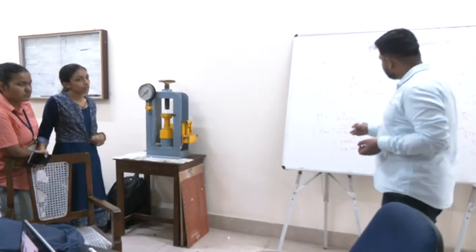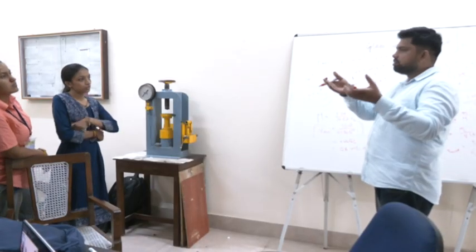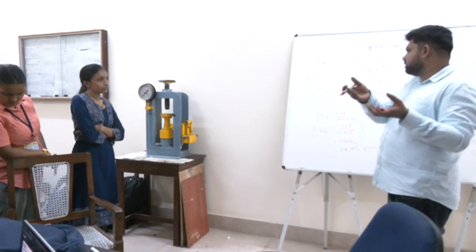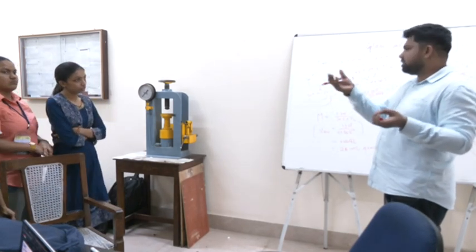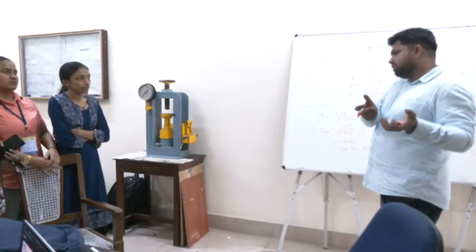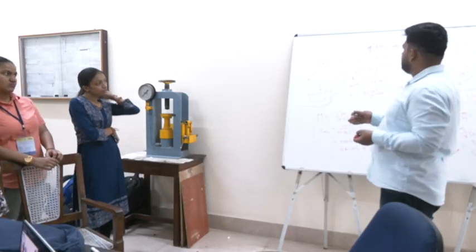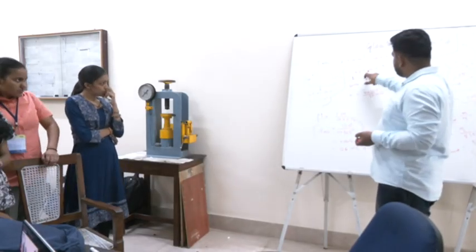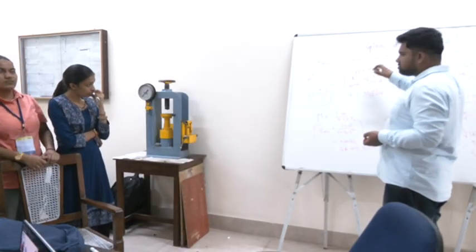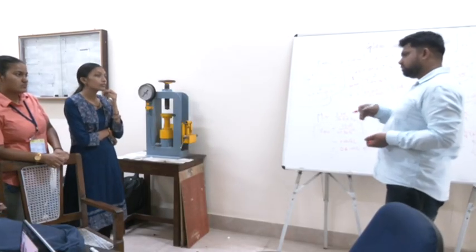Sometimes it happens that we take concentrated HCl directly from the bottle, 36%. It is pure HCl. At that time also, sometimes we don't get the gel. So it is not a fixed formula. We got the gel at 3 molar HCl also, and 2 molar HCl also. So you can change the strength of the solution according to your situation.